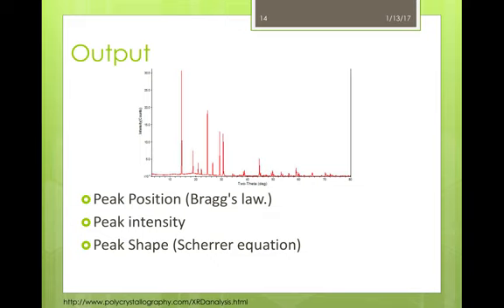XRD also takes into account the width and the shape of the diffraction peaks by using the Scherrer equation. This relates the peak width and the crystallite size. Here at CMSC, we use a program called JADE that analyzes the XRD peaks and profiles using these characteristics. It's an extremely powerful program, and I suggest you look into using it more.